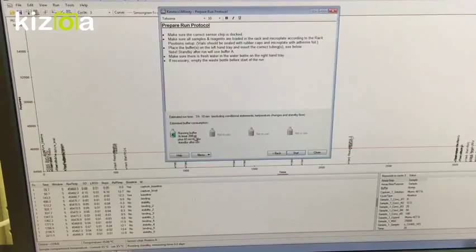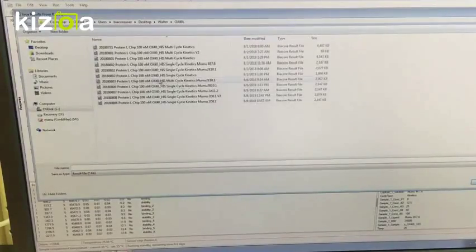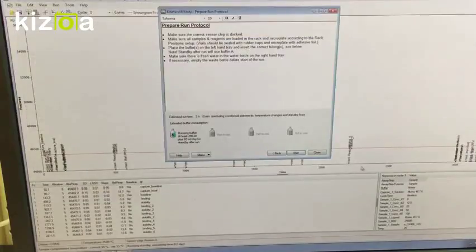All right, so here is the last step where you will be running the assay. You can hit start. Once you hit start, you save the template under a particular name that you are looking for. But if you don't want to save it, that is also fine, because you can also set it up every time you need to do it. So I'm going to click on don't save, and then it tells you where to save the results, and you can go to different folders. And this concludes the way to set up a kinetics assay.